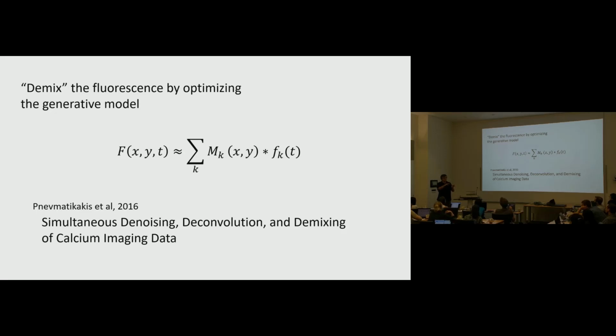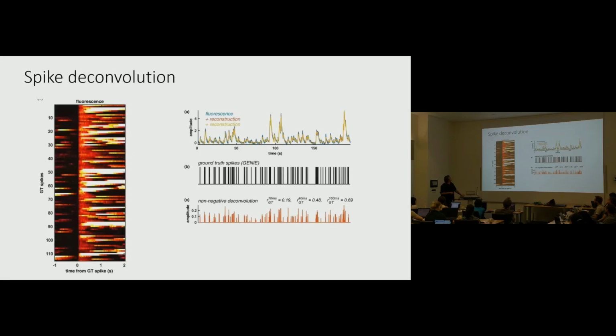We have plenty of pixels outside of it to estimate the selectivity from. But at some point, your recording is so dense that there's a lot of overlap between a lot of things, and then you can't do that anymore, and you have to think more carefully about demixing these activity sources. So let's see if we get into that scenario with some of these dense labeled data sets.